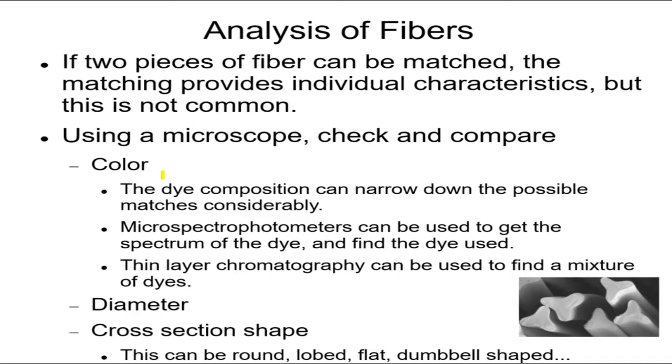But remember that when we mentioned absorption of light, and the light that gets absorbed by something and the light that gets reflected by something, if it's a color, it's absorbing some light and reflecting other light. Now, the human eye might be able to only differentiate between, let's say, 10 or 20 colors of blue. But the spectrophotometer knows exactly which wavelengths were absorbed and which were reflected, such that it has this shade of blue, and that can make a lot more differentiation.